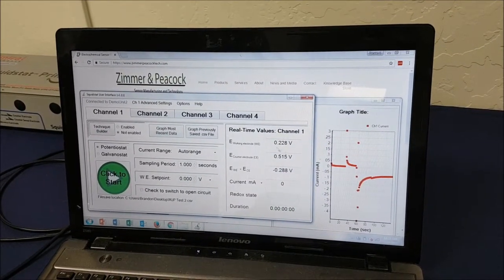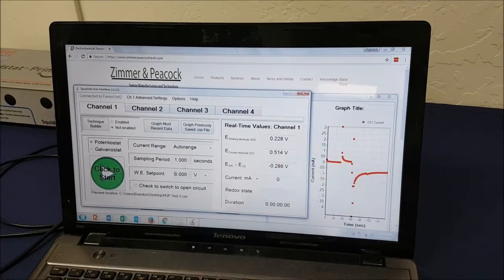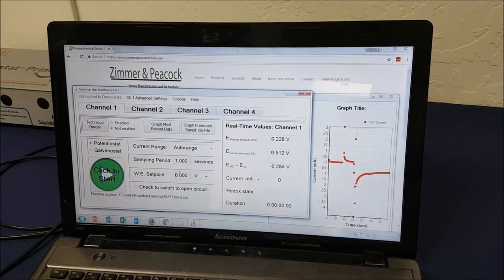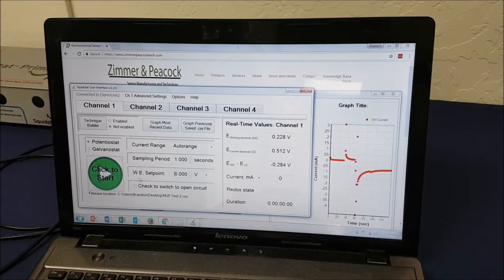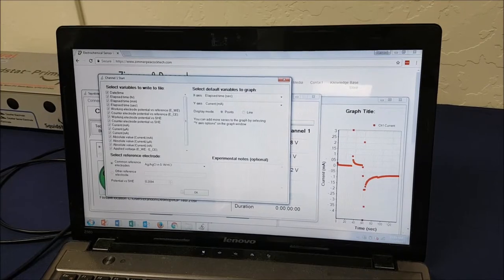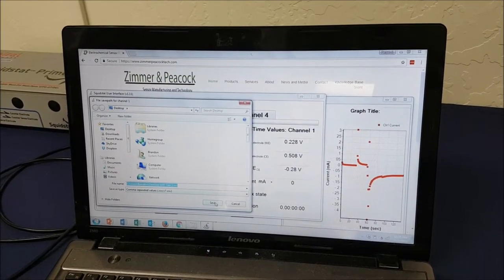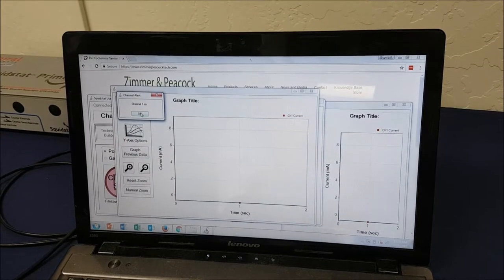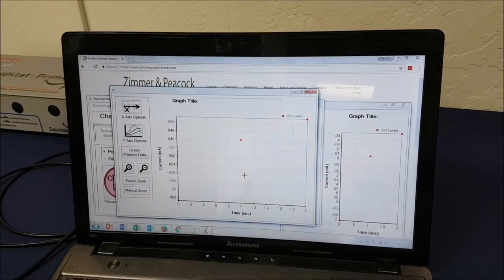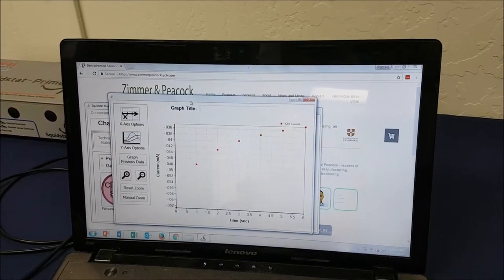I see what my working electrode's doing. I see what my counter electrode's doing. I see the difference, so I can see what's going on in this cell. I say that it's very intuitive. Literally, I'm going to just hit start. It's going to ask me a few questions. I go, yeah, sure, I'm happy with that. I'll save the data. And then it just tells me that that channel's on, which is all very great. And it's gathering the data now at this point.